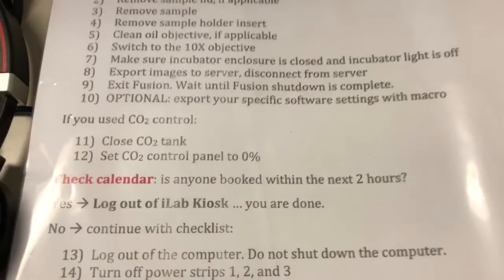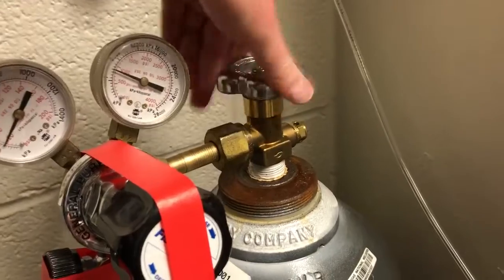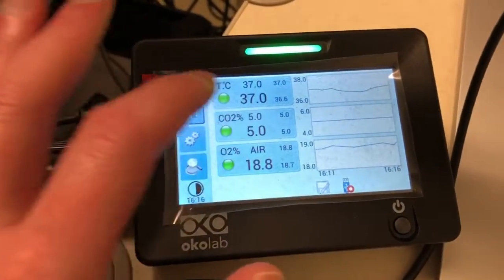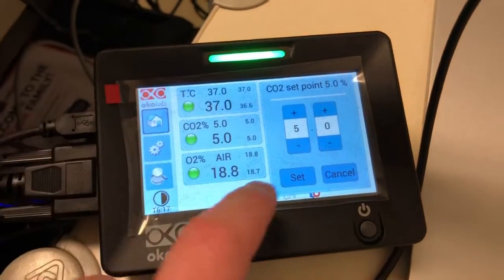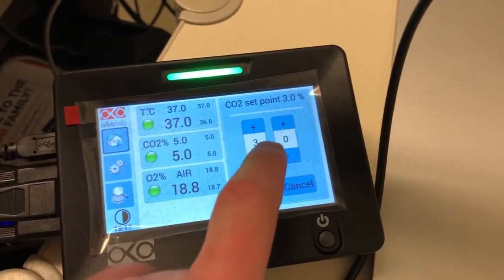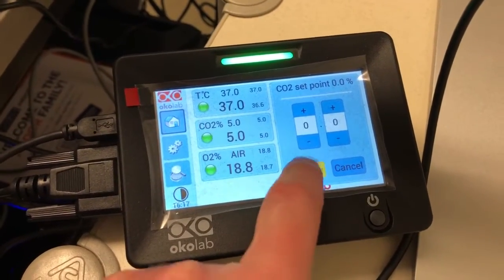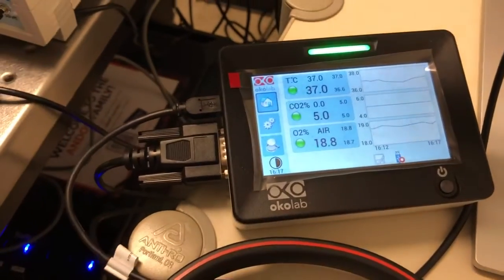The next step is to close the CO2 tank if you used it. The CO2 tank is here and you can close it by turning it clockwise. In addition you have to set the CO2 control panel to zero percent — you can touch this to do so — which will make sure that an alarm doesn't go off when the CO2 drops.